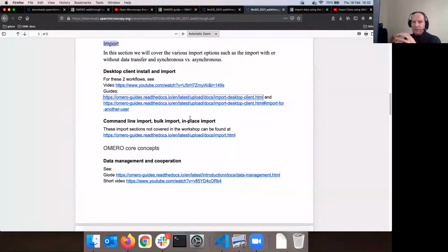What is there to say about it is that the OMERO.insight import is using something which we call graphical user interface. If you never did any programming or any computing, that's what you think is computing. Basically, kind of always a window where there is plenty of buttons and drop-down menus, and so this is what is called graphical user interface.